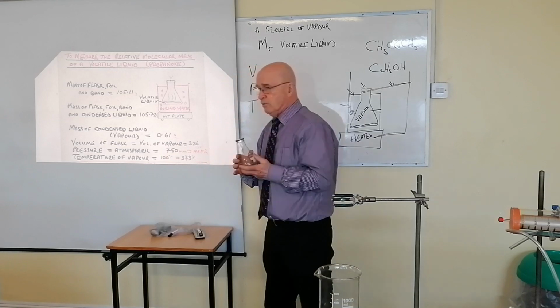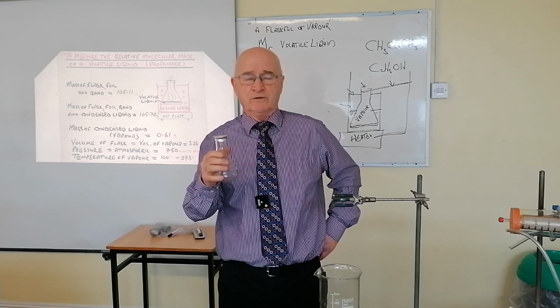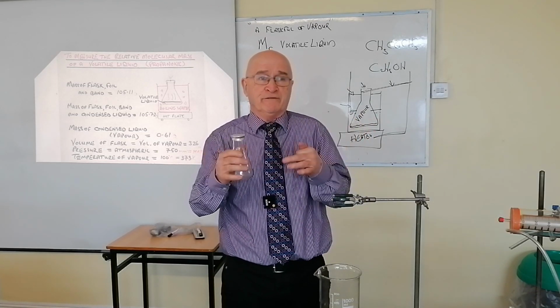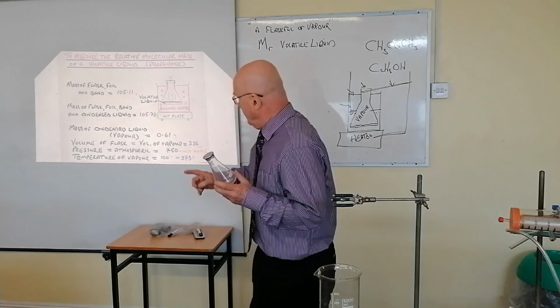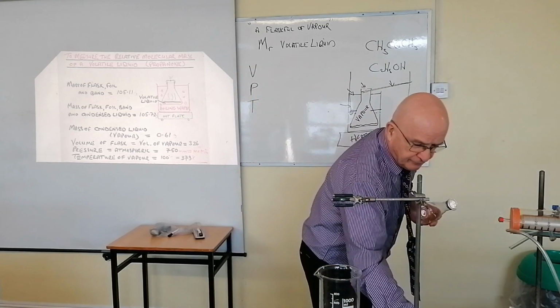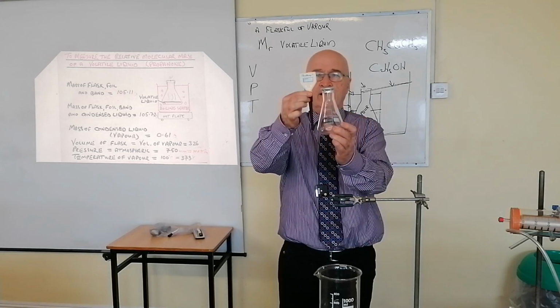And the temperature, of course, is the temperature of the boiling water. Don't be surprised if they have told you in the question that the water was at 99 degrees or 98 degrees or 98.5. By all means, if you're just describing something, suggest the water is boiling, so it's 100, that's okay. But they may give you a specific value. How would you measure it? I've told you already. You put a thermometer in here and leave it there. I have a little electrical thermometer, and that could be immersed in the water and left there, next to the flask while it's going on.